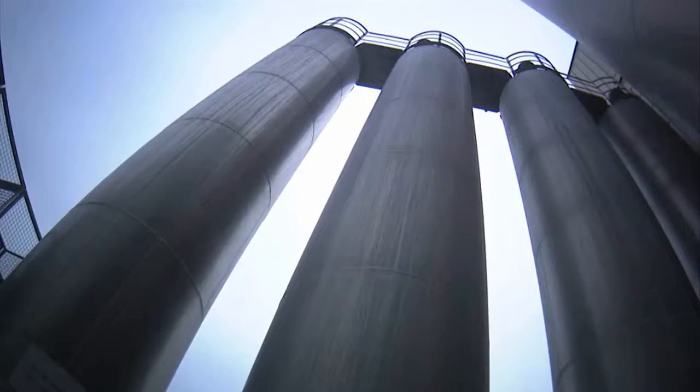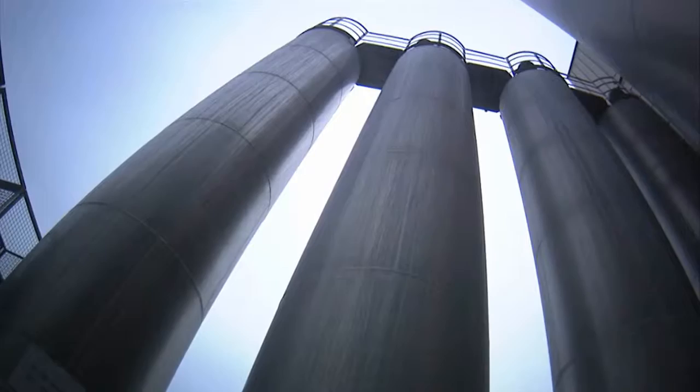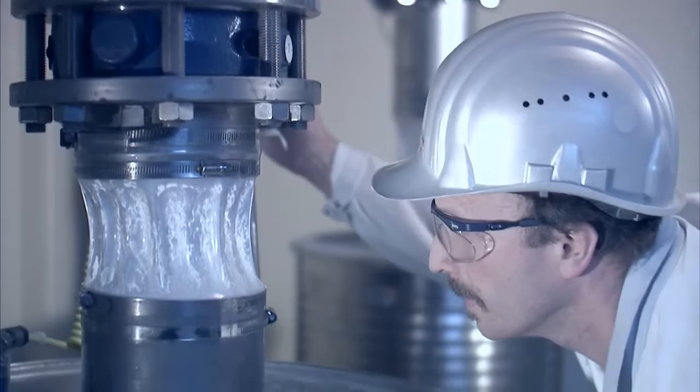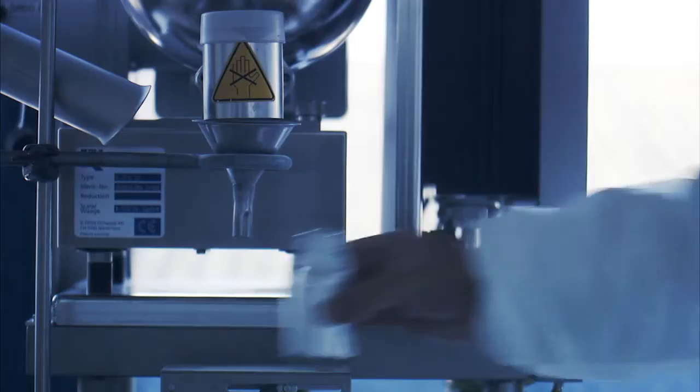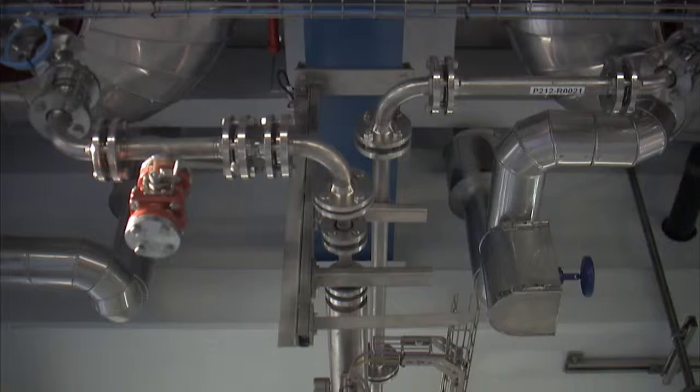Merck recently invested in a new modern chromatography production center, equipped with the latest cutting-edge technology for reactors, solid-liquid separation units, closed product filling apparatus, and using highly sophisticated process steering software. The new center enables the production of modified silica gels that meet the demands of our customers.